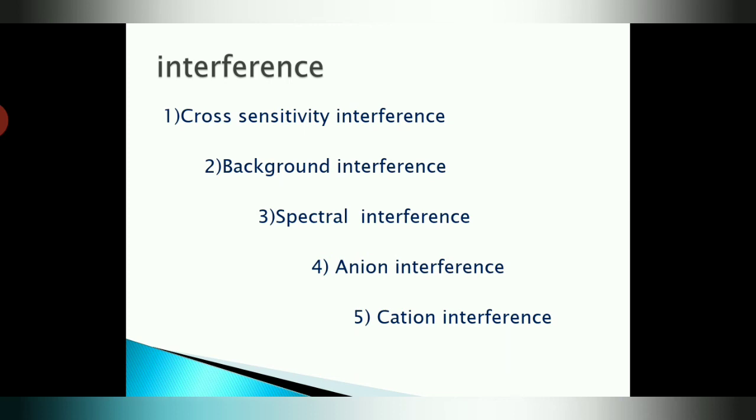For example, chloride causes a dissociation interference, and the chlorine ion also affects the ionization through the formation of Cl ion into the flame. The other ions also play an important role here. For example, phosphate and sulfate can cause vaporization interference with alkaline earth metals, through the formation of non-volatile alkaline earth phosphate or sulfate.